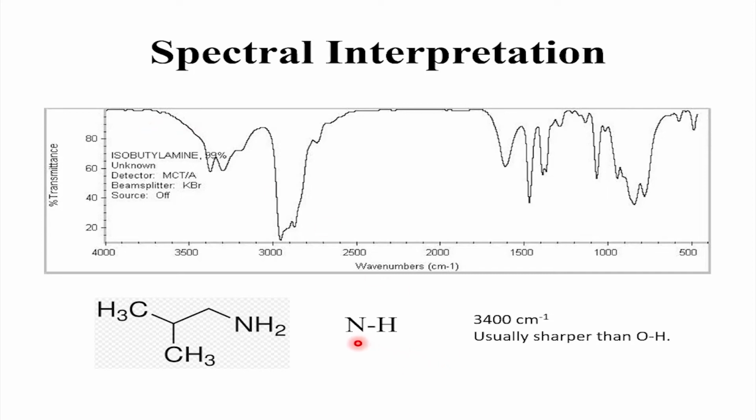Since we already know the bond strength as well as the mass of these elements, we can actually calculate those and put them in a table. Later you do an FTIR, see what absorption bands are present, and compare the frequency of this absorption with the tabular column we already have. We can identify the chemical composition of the samples. This was the theory and how to do the spectral interpretation of FTIR spectroscopy. Now let us move on to the hands-on demo on how to prepare the sample and how to do the analysis using an FTIR spectroscopy.